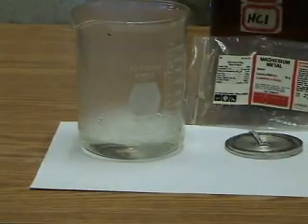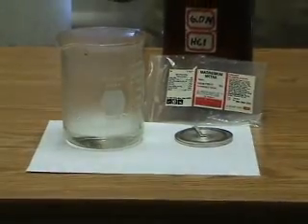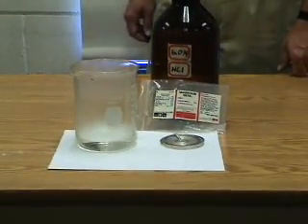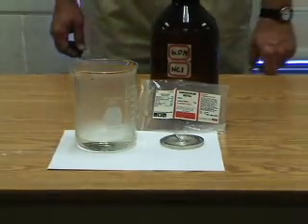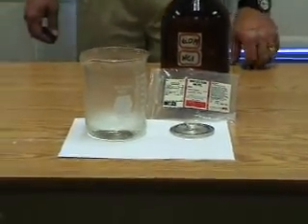The magnesium reacts with the acid to produce hydrogen gas and magnesium chloride salt. The salt is soluble, and so it remains in solution, and the solution remains clear and colorless. The reaction is exothermic. You may see a bit of steam on the side of the beaker, which has condensed there.